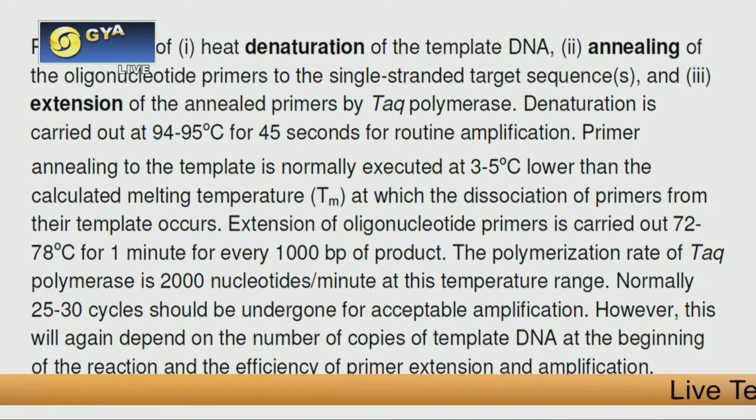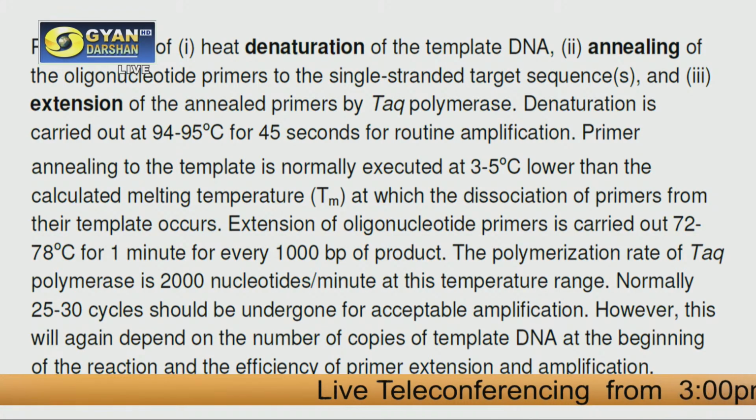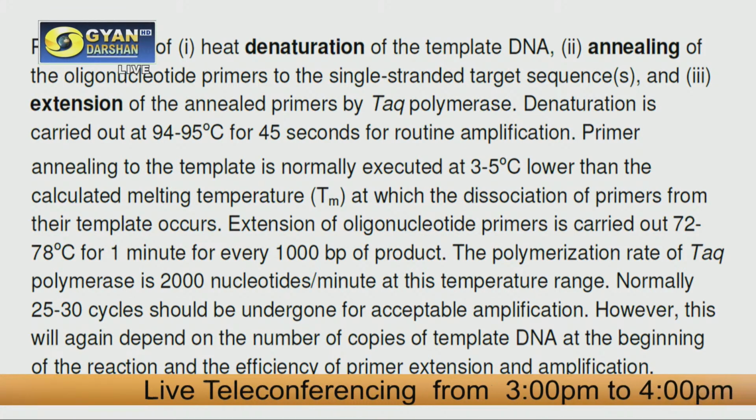Twice (A plus T) plus 4 (G plus C). A means A plus T, GC means G plus C. Remember this. So based on that you can calculate the melting temperature, or Tm, of the primer. For the forward primer you will have 1 Tm, and for the reverse primer you will have another Tm. And plus minus 5 can be adjusted to set the final annealing temperature.